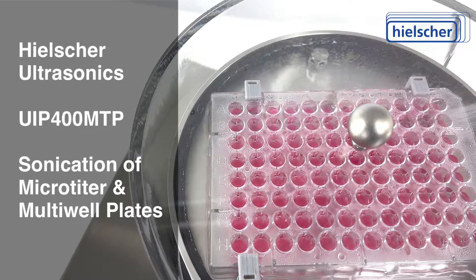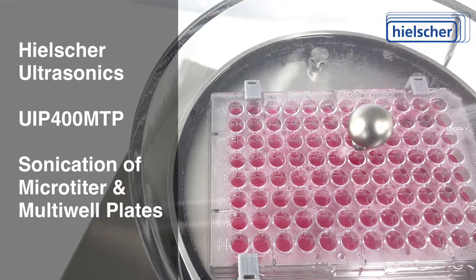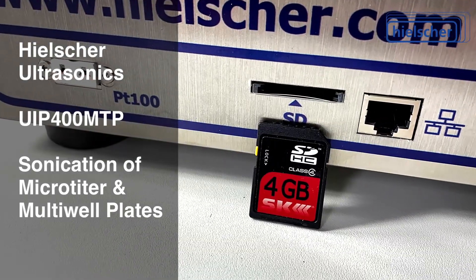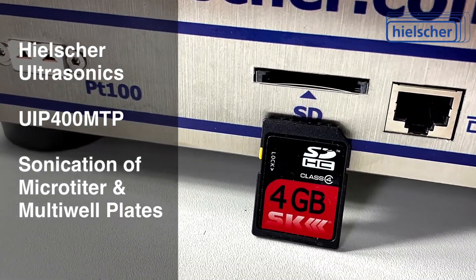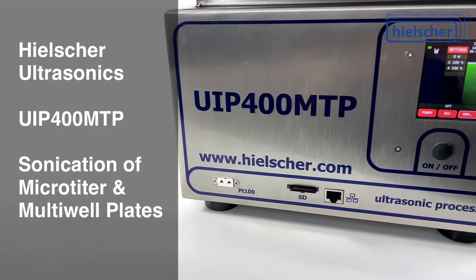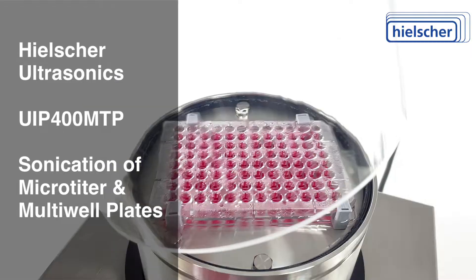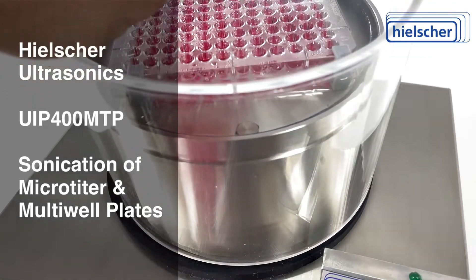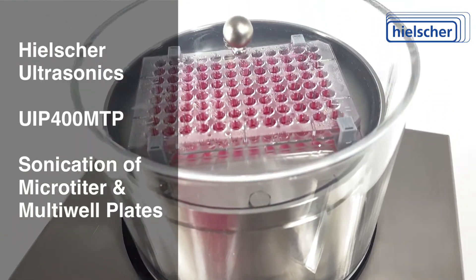The UIP-400 MTP provides reliable and reproducible results. It automatically writes a detailed protocol for each sonication to an SD card. This is essential for accredited laboratories and certification of analytical protocols. The acrylic acoustic enclosure provides a 360-degree view of the microplate during sonication.